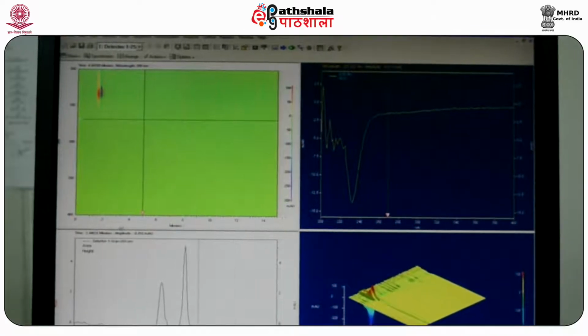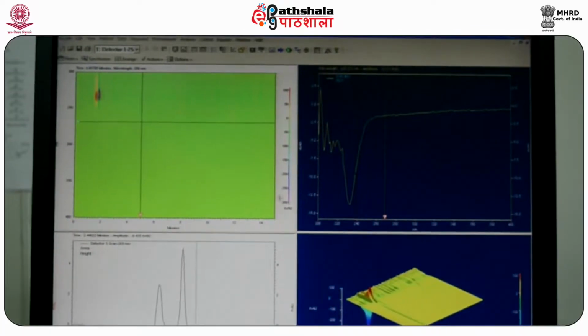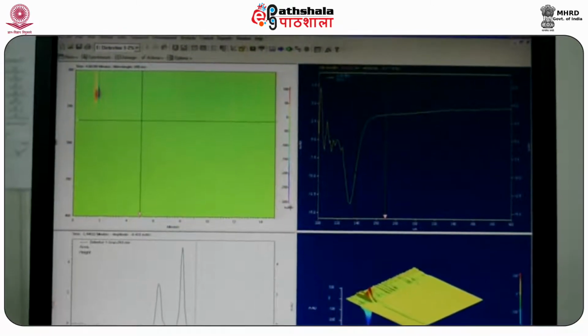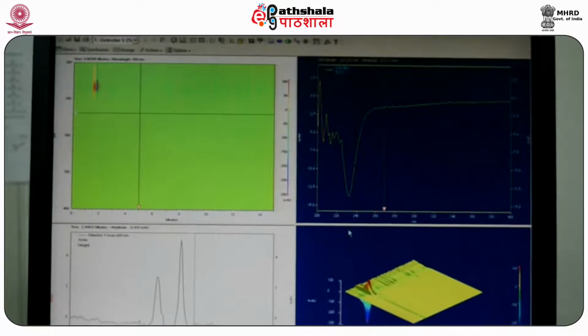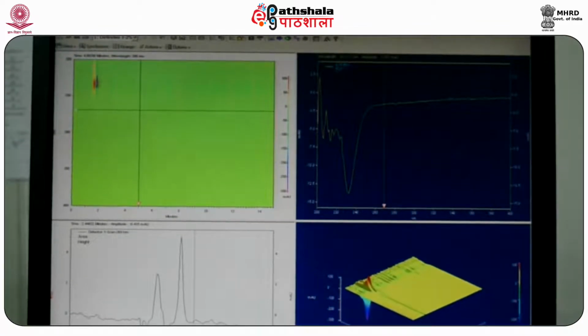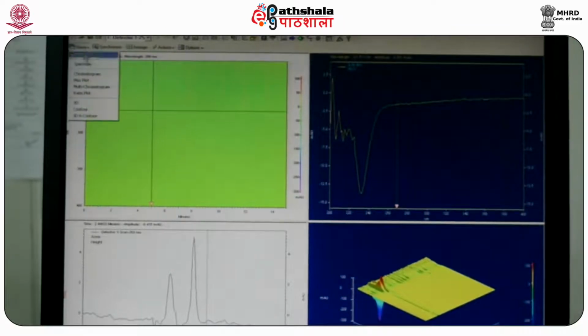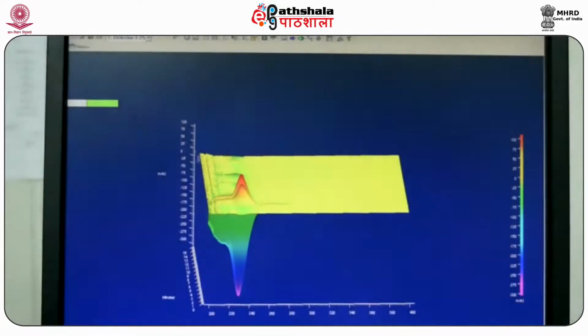However, you can see more information about other peaks by using another option, as we are using a photodiode array detector. Here I am trying to show you the application of both the single channel UV detector and the purpose of the PDA detector. Look, you get a three-dimensional view.